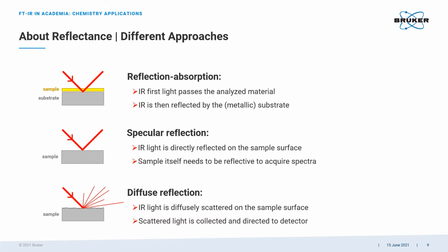by expert spectroscopists. However, if applied correctly, the spectral quality is excellent and diffuse reflectance IR spectroscopy, or DRIFT spectroscopy for short, can achieve things that other techniques cannot. Examples would be in construction chemistry, where new cement compositions are optimized.